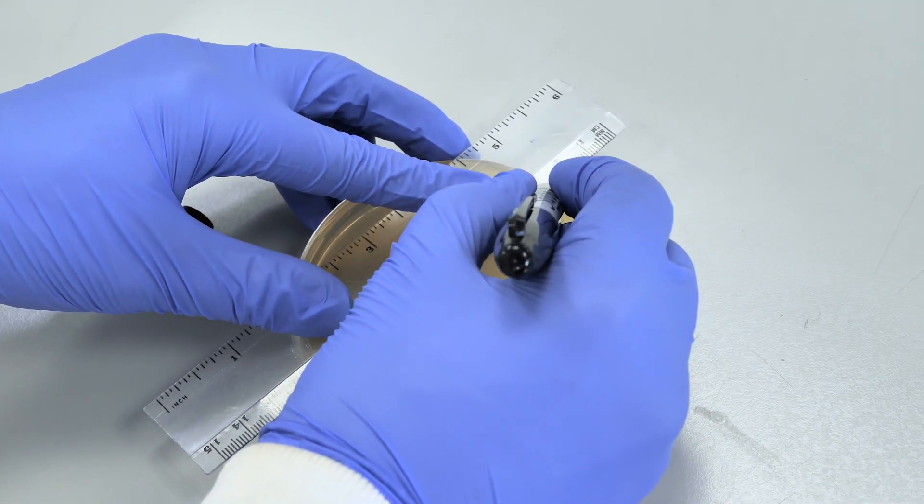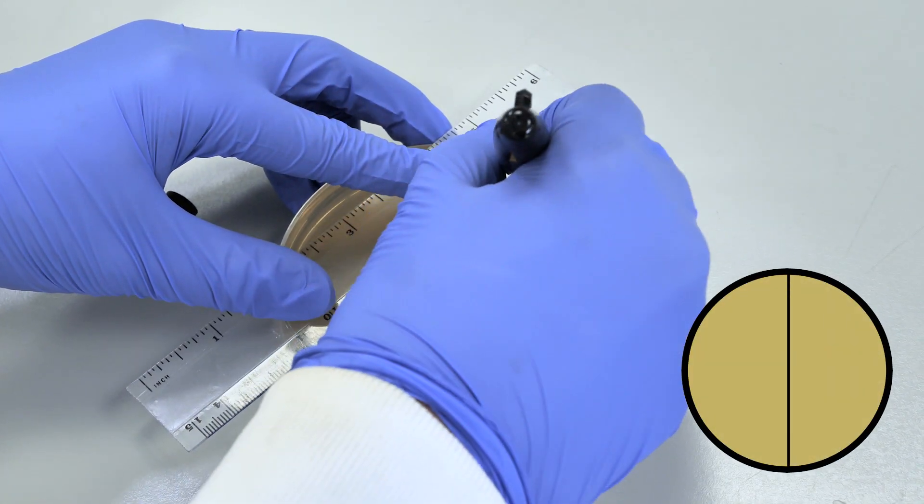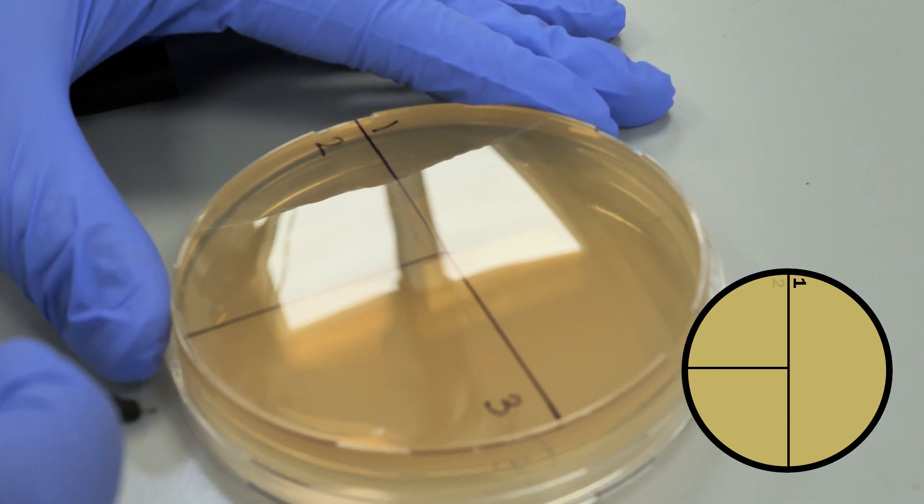Next, divide your plate into three sections using a T-shaped division, numbering each section as shown.